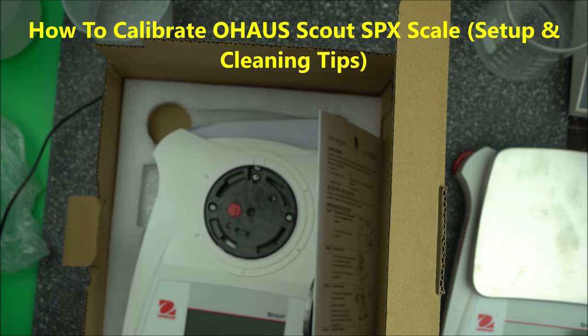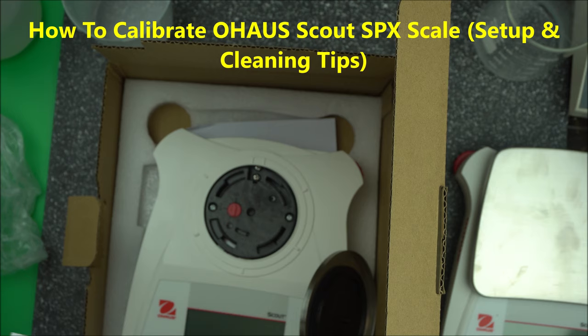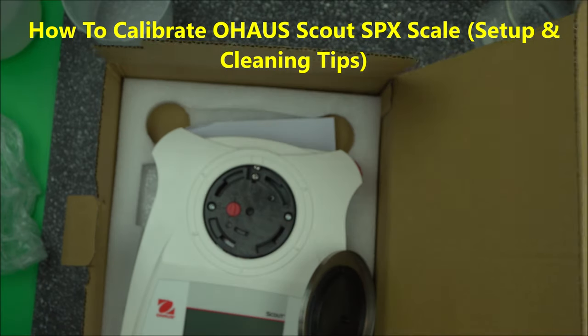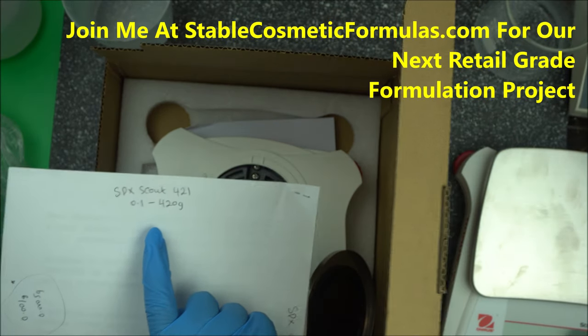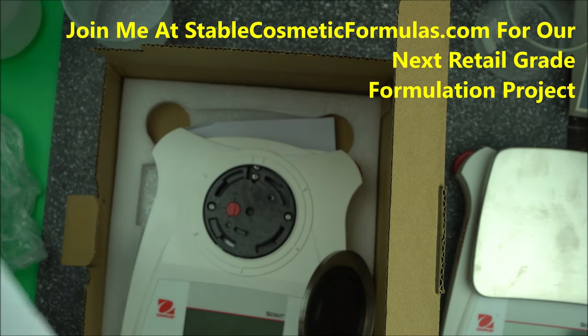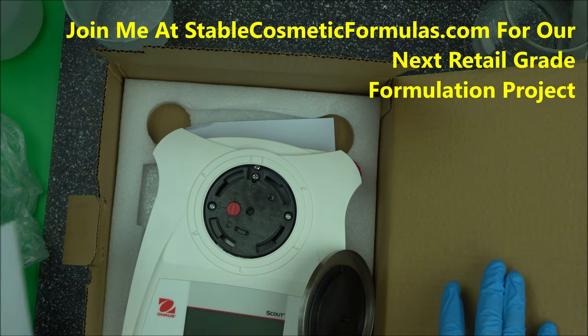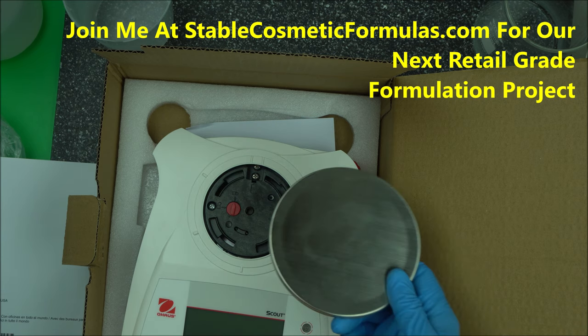Hello everybody. In this short video I'm going to show you how to set up your Ohio scale. The one I'm going to talk about is the SPX Scout 421 — it starts from 0.1 to 420 grams. It's an electric balance scale that gives you accurate results in decimals.